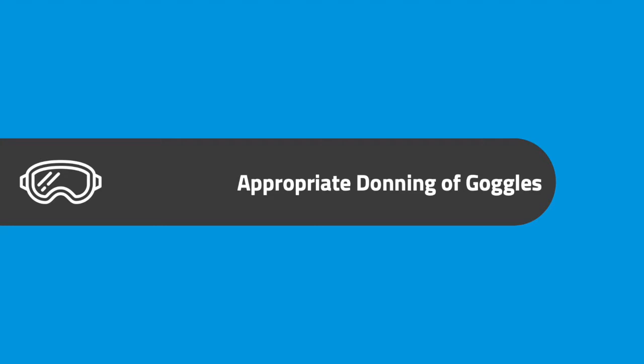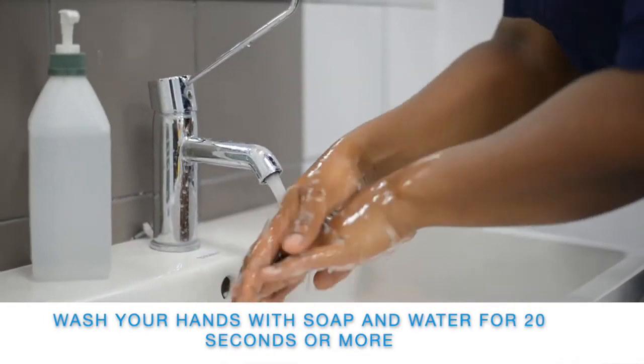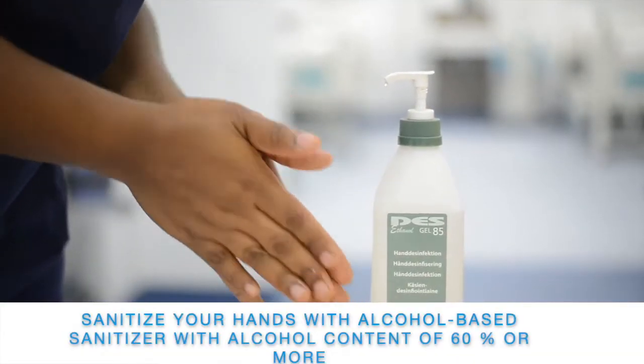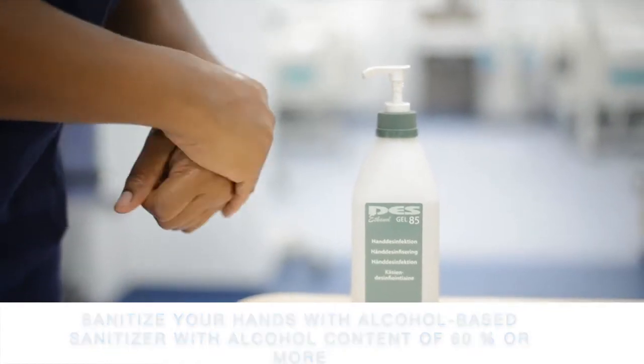Appropriate donning of goggles. Wash your hands with soap and water for 20 seconds or more, or sanitize your hands with an alcohol-based hand sanitizer of an alcohol content of 60% or more.